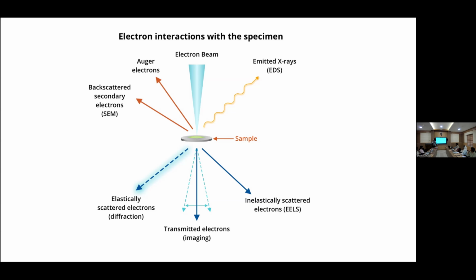It should be there in your mind because in image interpretation it is very important. If you place this like this, we can see the shadow like this. If you place this like this, you will get this as a sphere. So you may misinterpret this as a sphere. That is a very important thing in TEM image analysis.